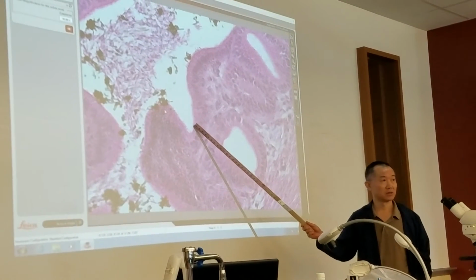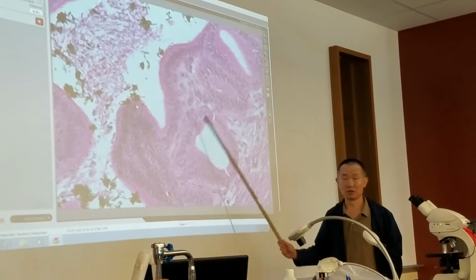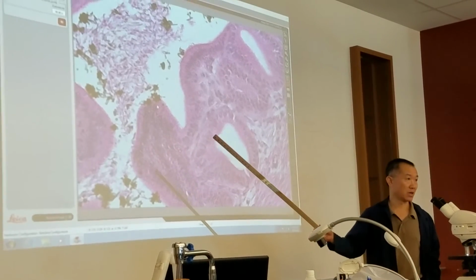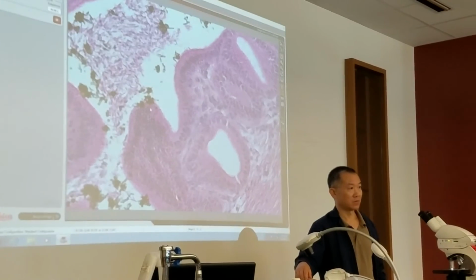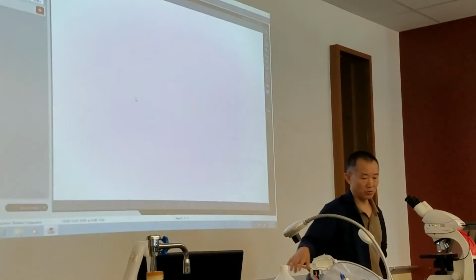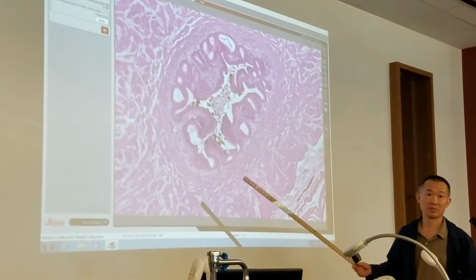All right. So I may ask you this question, and I ask you the organ's name. It's the vas deferens. So the vas deferens is the whole circular thing? The whole thing. Okay, this whole thing is the vas deferens.